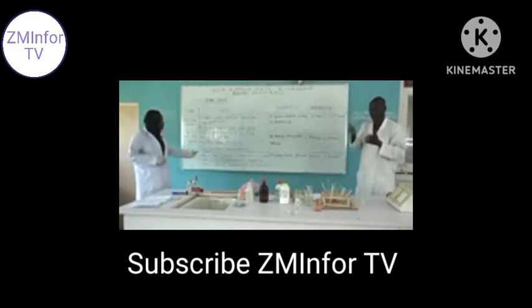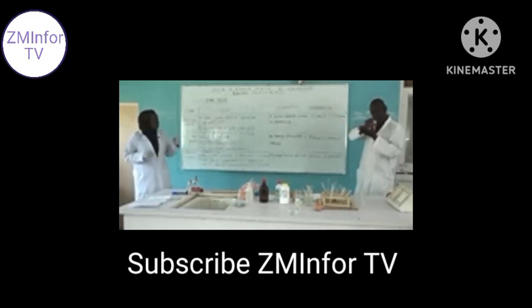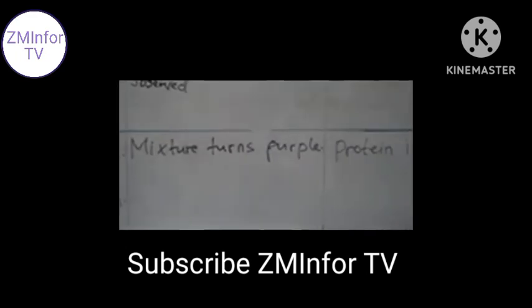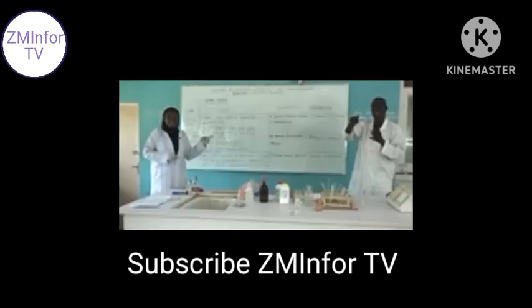We have tested for proteins. We took a small quantity of fresh milk. We added sodium hydroxide solution and copper 2 tetraoxosulfate 6 solution. We have observed the mixture turning into purple. And then that purple color tells us that protein is present in the milk.